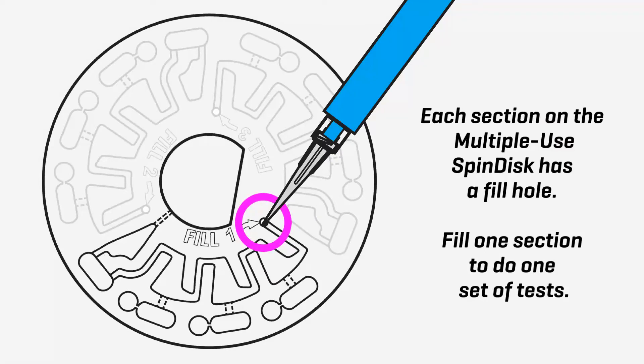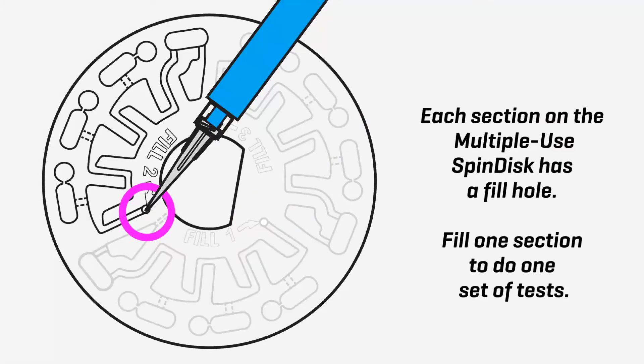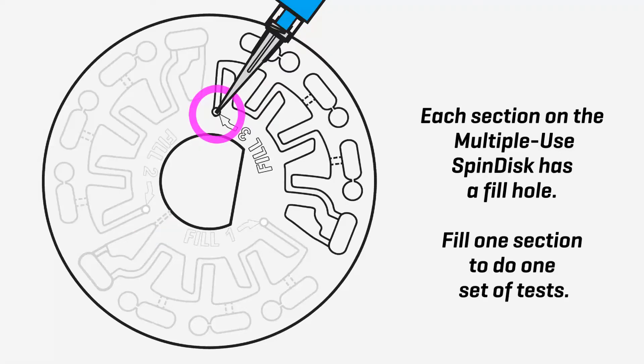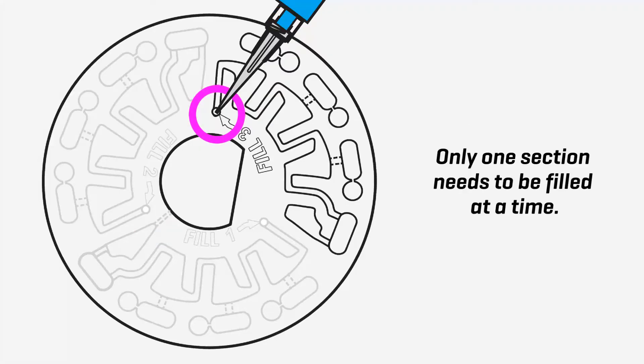Each section on the multiple-use spin disc has a fill hole. Fill one section to do one set of tests. Only one section needs to be filled at a time.